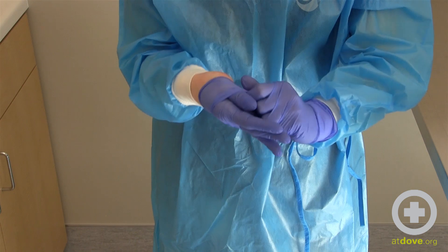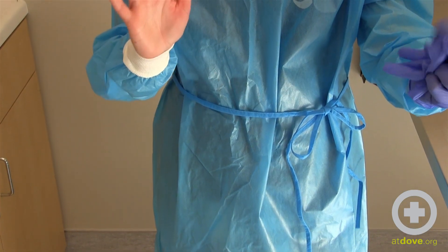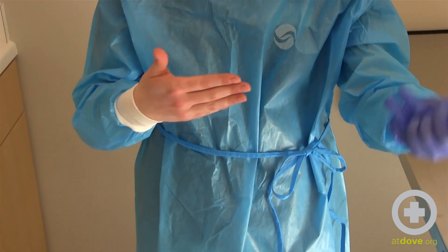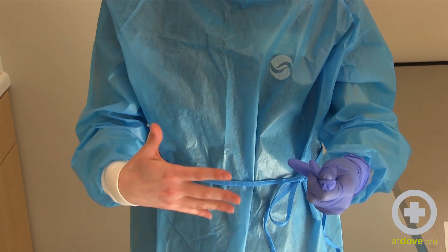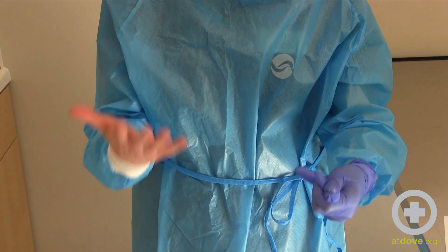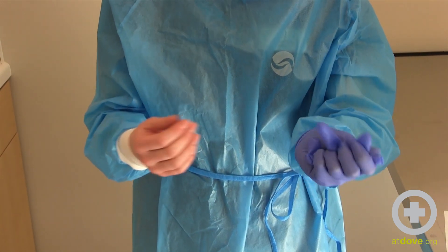You're going to work this down and then pull your dirty glove off into your other hand. This is now your clean hand and dirty glove in dirty hand. If you accidentally touch any dirty or contaminated part, make sure that you wash your hands or use an alcohol-based hand sanitizer.